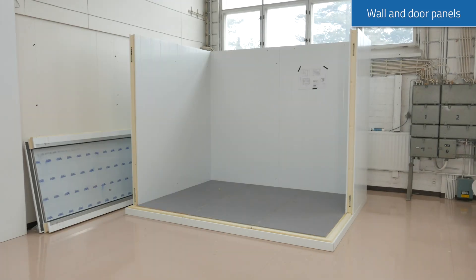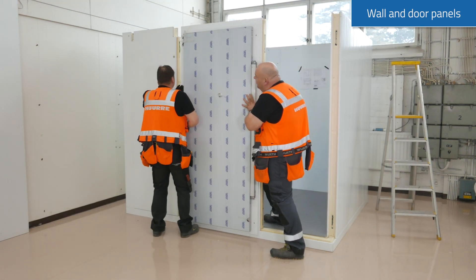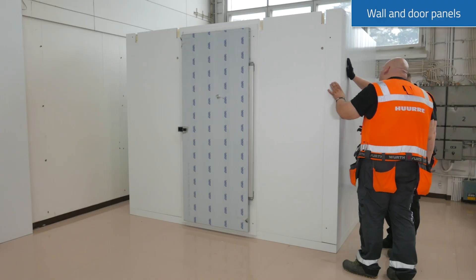Continue installing all the wall panels. The door is factory installed in the unijoint door panel. Be careful while placing the panel not to damage the floor panel's joints.